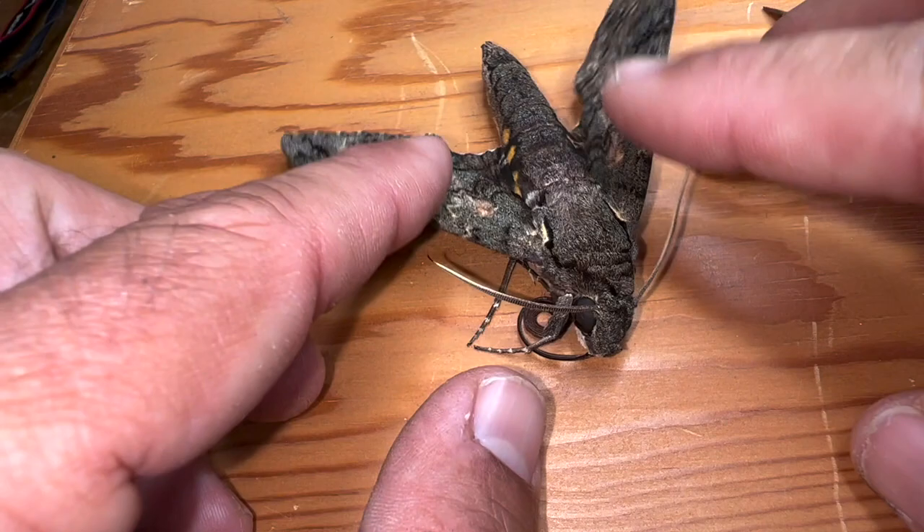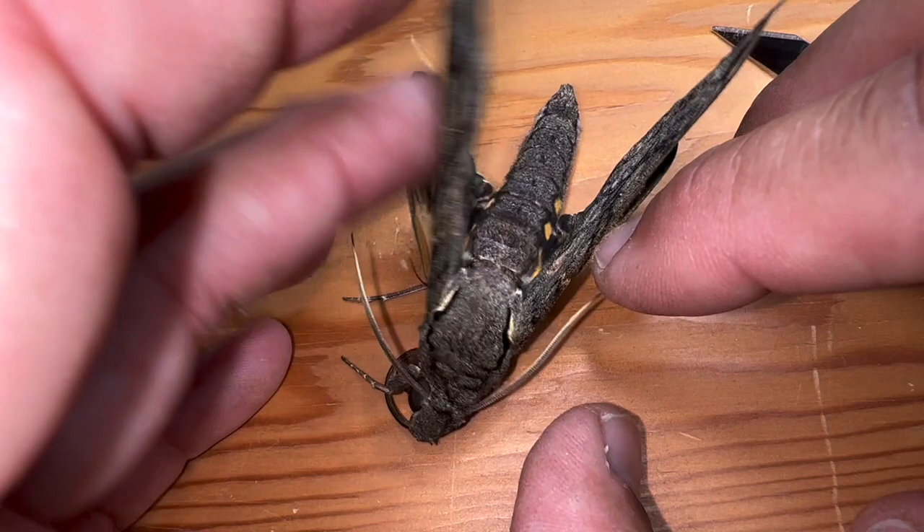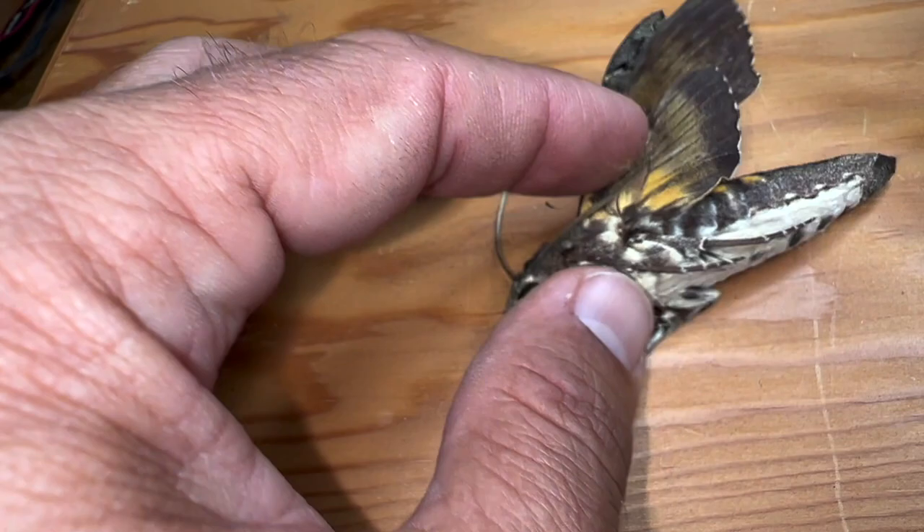Let me show you the difference. This forewing on the treated side is much more flexible — when I move this side, the whole body moves. When I move the other side, the wings move without moving the whole body. But I still have to do the other side, so now I'm going to do it much quicker. You don't actually have to remove the scales if you know where to cut.